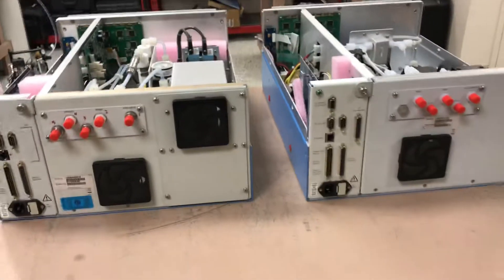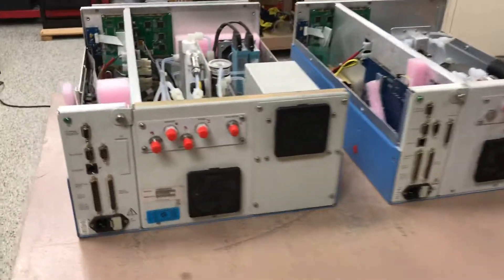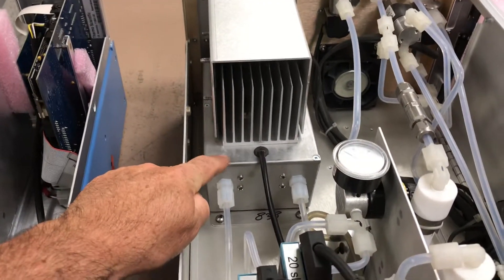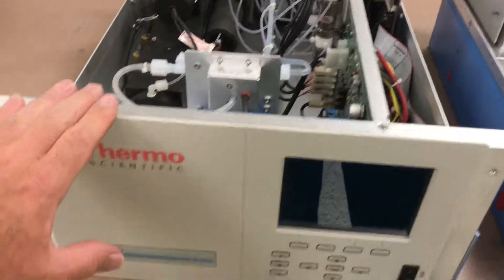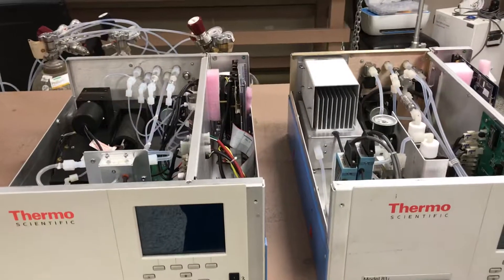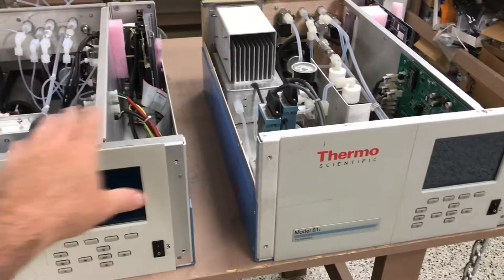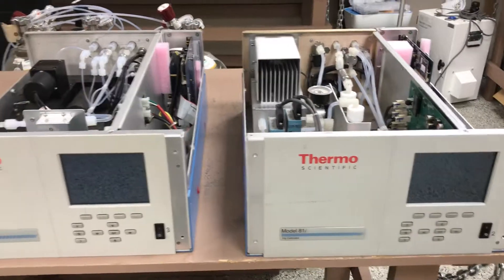Together, those are the back panels of the Mercury Analyzer and Mercury Calibrator, which are part of the Thermo Scientific Mercury Freedom System. We have these around quite a few of the coal-fired power plants here in Alberta. A mercury material inside the calibrator has air diluted across it to generate a known mercury concentration — typically 10 micrograms per cubic meter — which is fed into the mercury analyzer for daily span checks. There's a full rack in the shelter with a probe controller and umbilical heater as well. All units communicate with each other to maintain daily zero and span controls, and you can control the system remotely from the control room.